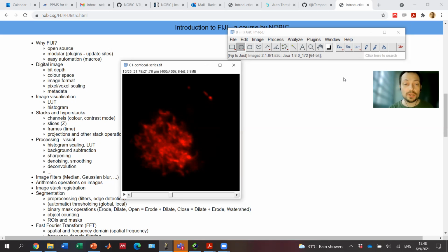Of course, for each specific problem, for each type of structure you want to image, ideally you should train the neural network on something which simulates the type of structure that you want to image. Otherwise, again, you have the same problem that you might be creating artificial structures.